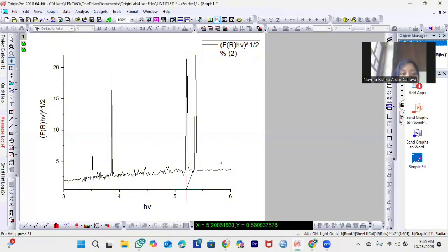Okay, it's 5.21. We choose the line and then to make it clear, we maximize.